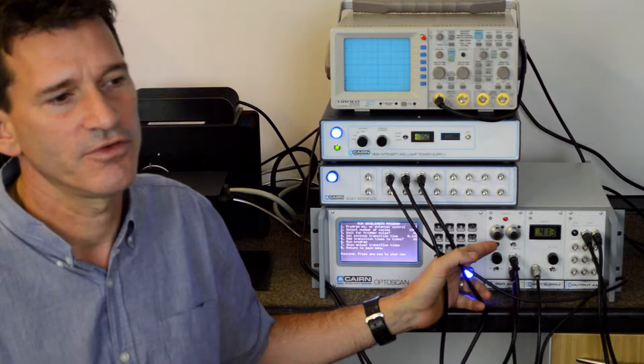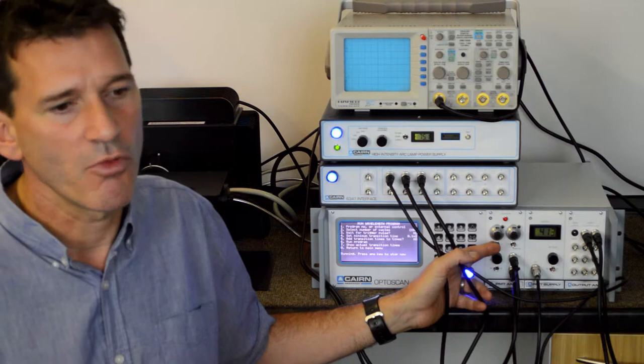So what I want to do is run the photomultiplier power supply in the region of 600 to 800 volts because this is the area where the photomultiplier will be linear.